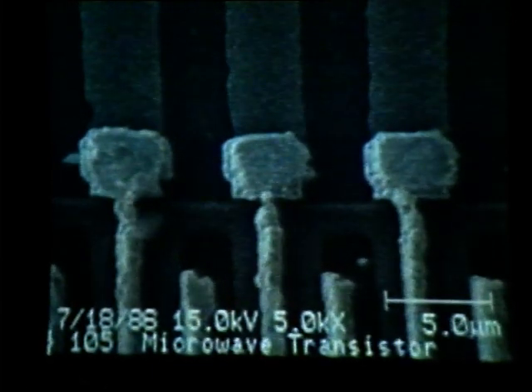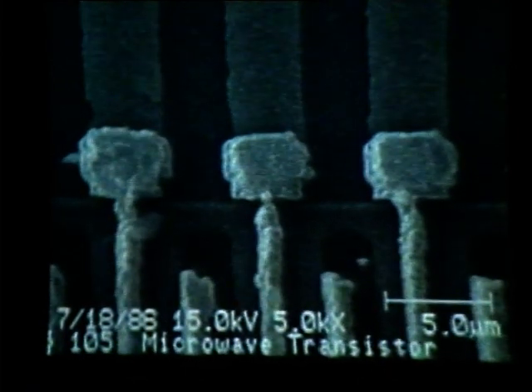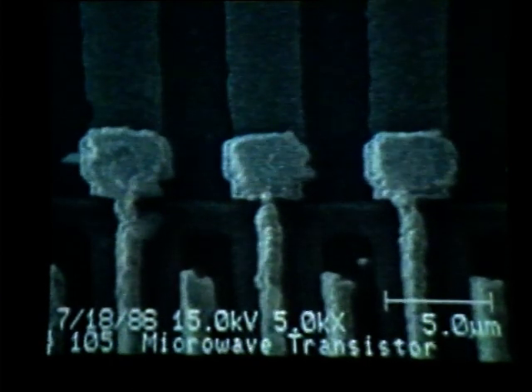The computer will respond by telling us to open shutter, strike enter to proceed. If we find we do not want to continue with the photo, what we could do is press escape to abort. Then we would not have to go through the photo routine. Pressing function key 20 also superimposes on the TV image what fields we have turned on. If we agree with the fields that we have turned on, we can then continue the photo by striking enter.